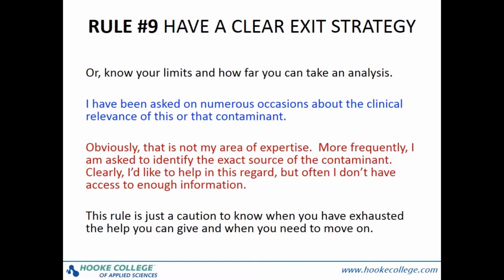I was often asked how many items have to be contaminated before the whole lot is lost. First, there is no real simple answer to this, and second, I'm not really qualified to make that determination. More often I was asked my opinion of the probable source of the contaminant. For gaskets and such, maybe I could help. Most frequently, though, I did not have sufficient access to the manufacturing line to hazard a guess. Finally, the skill set required for analysis is somewhat different than that required for mitigation and re-engineering. It's, I think, important to know what our own limitations are.